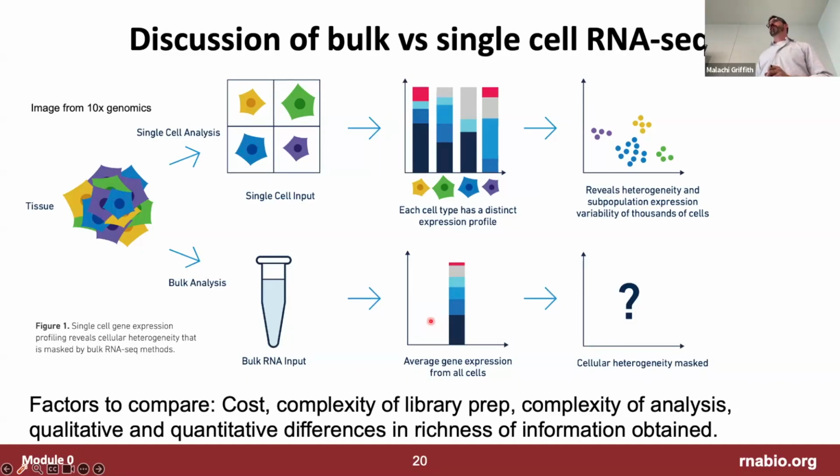So the comment was that in single cell you have single cell level gene expression estimates, but the readout is much lower. Genes that aren't abundantly expressed, you're not able to detect that well. Even a moderately expressed gene, you might be able to get really good differential gene expression analysis from the bulk approach. But when you go to single cell, you just have a few reads. And so it's hard to tell the difference between condition A and condition B, or sample type A and sample type B, cell type A and B. Yes, that is true. And that's arguably the biggest limitation, I would say, of single cell.